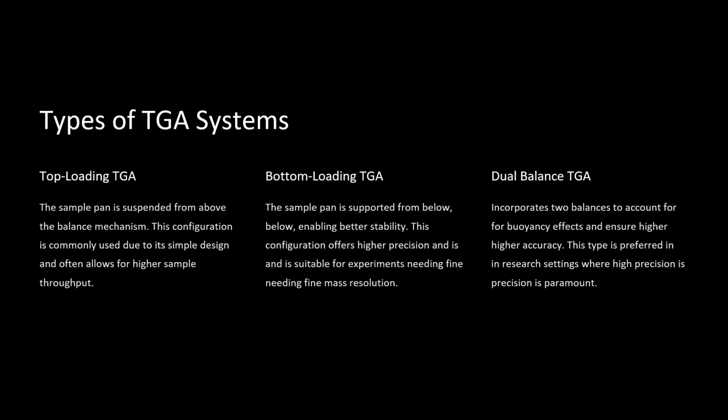It features two balance systems, one for the sample and another for the reference material. It provides simultaneous measurement, enhancing precision by compensating for environmental fluctuations. It is commonly used in advanced research application.